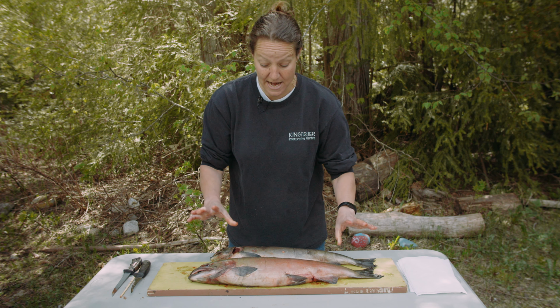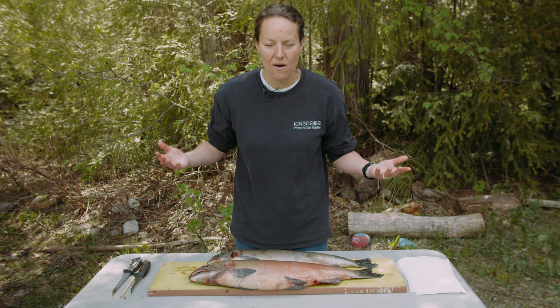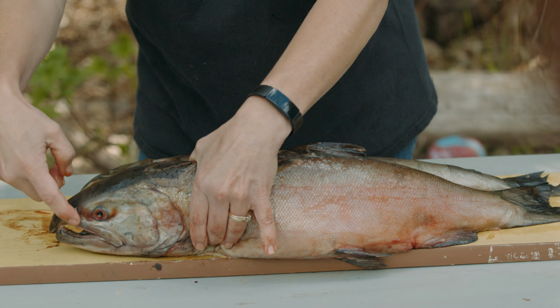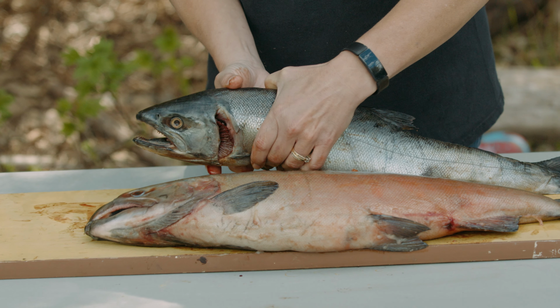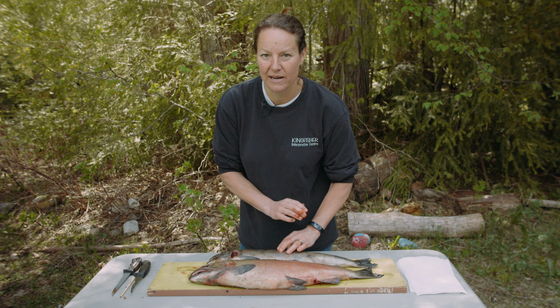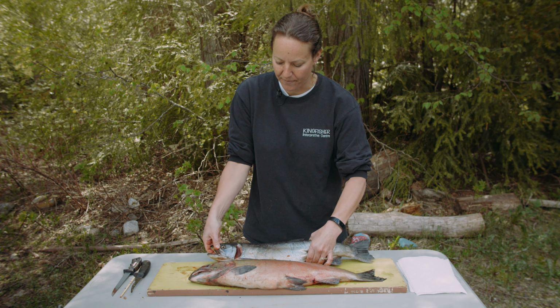Okay, excellent. Now, I have 2 fish here today. One of them is a boy, and one of them is a girl. How do we tell them apart? This one here has a hook in its nose. Does this fish have a hook in its nose too? No, it doesn't. So, boys and girls, the one with the big hook in its nose is the boy fish. So here's our male or our boy fish, and here's our girl fish or our female.